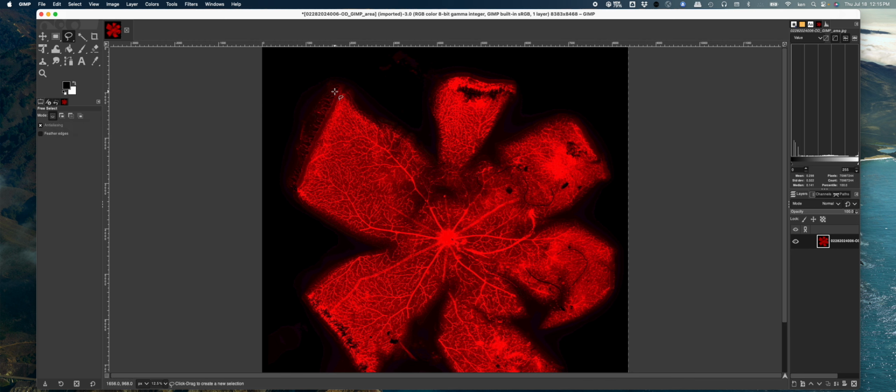The other trick using this lasso tool will be, if we want to zoom in, which we will, which helps us select the border, you need to move the image around. And the way we'll do that is, we hold down, and don't just press it once, we'll hold down the space bar. And that will temporarily give you a move grip, and you can move the image and then let go and just keep doing the tracing.